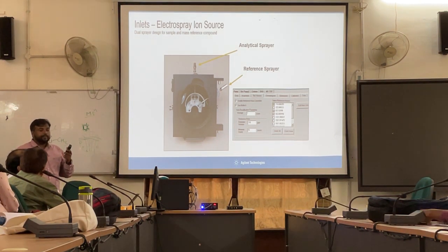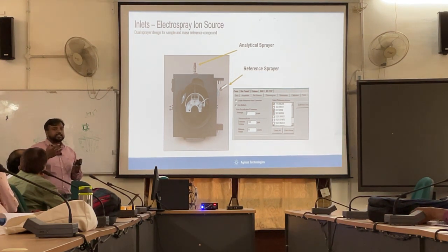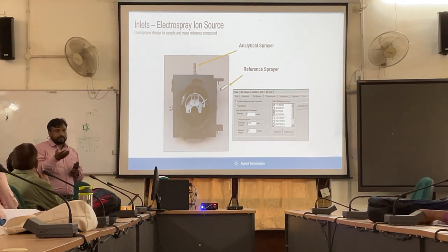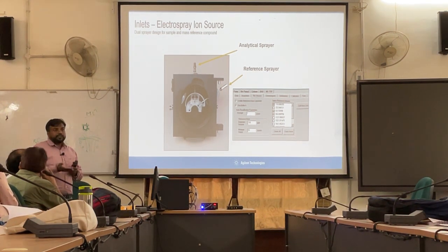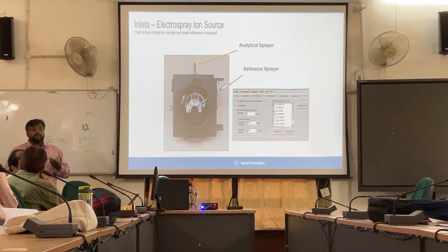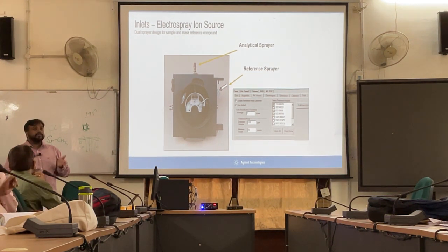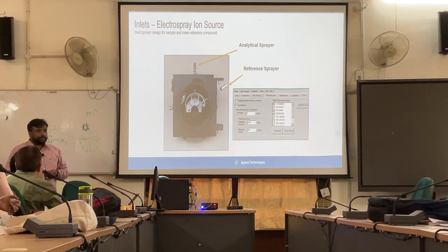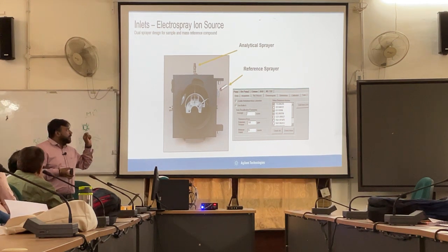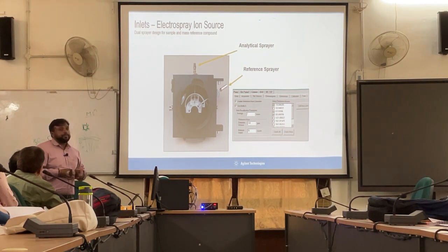Suppose we are having a long batch sample analysis and there is a probability of temperature variation or anything changing in the lab which can cause mass shift. So maybe some masses which you are detecting in the morning, in the evening that mass is not accurate. So probably the monoisotopic fidelity which you get in the morning would not be the same in the evening. To mitigate that, we have the option to start the analysis with the reference masses.